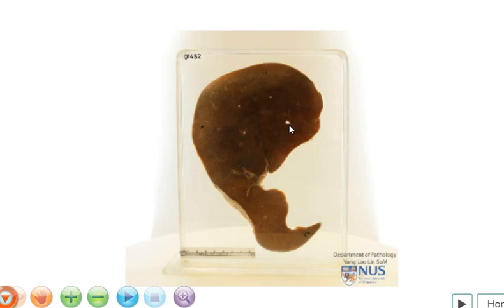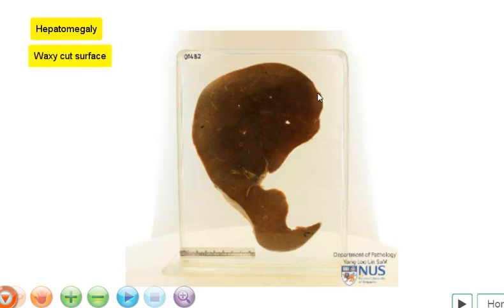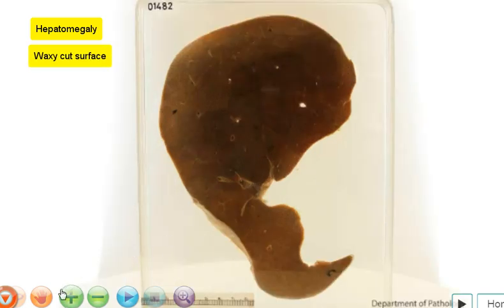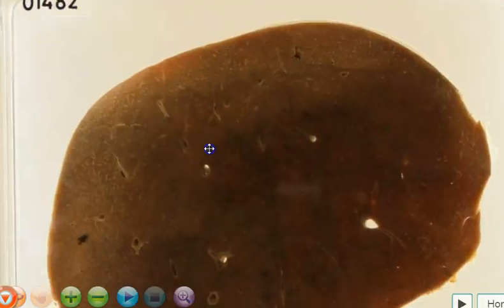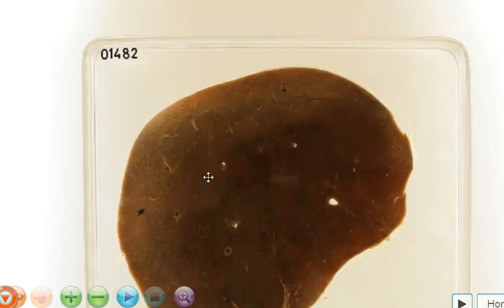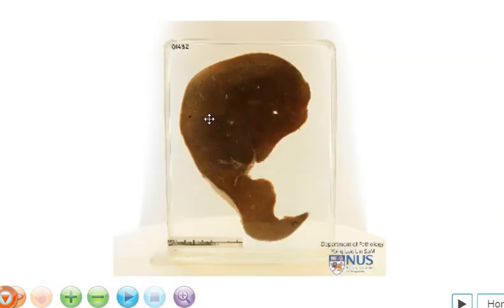The typical gross appearance of amyloidosis in the liver is that it can cause a variable degree of hepatomegaly. And usually on the cut surface, there is a kind of waxy appearance. It's not very readily appreciated here. Perhaps it is better seen if the liver is a little bit more fresh, and the texture of the liver would also generally be a little bit firmer than usual.